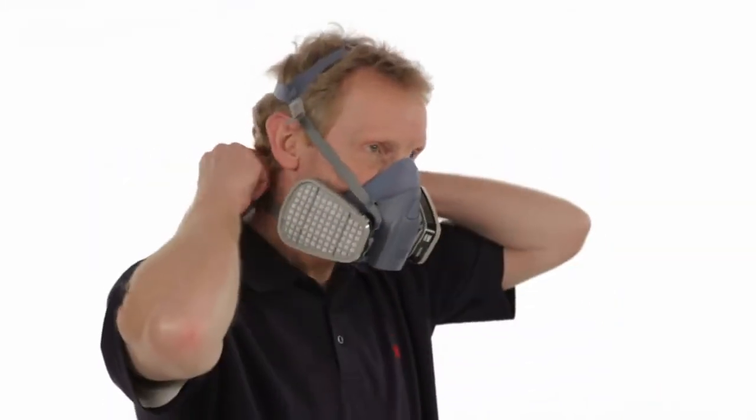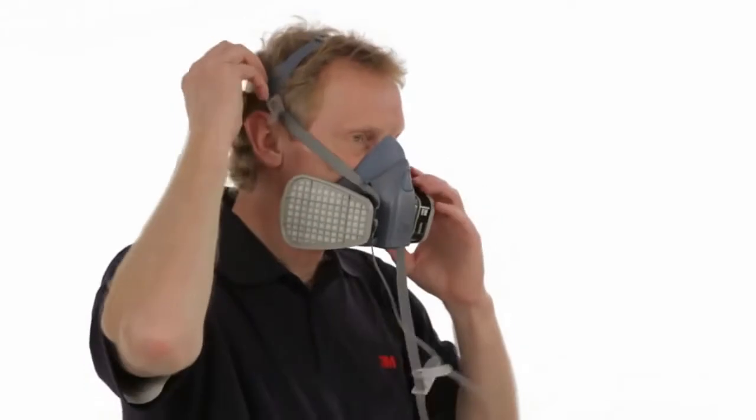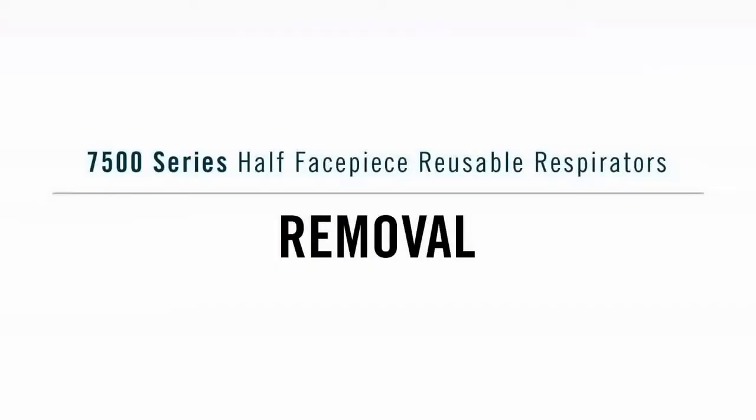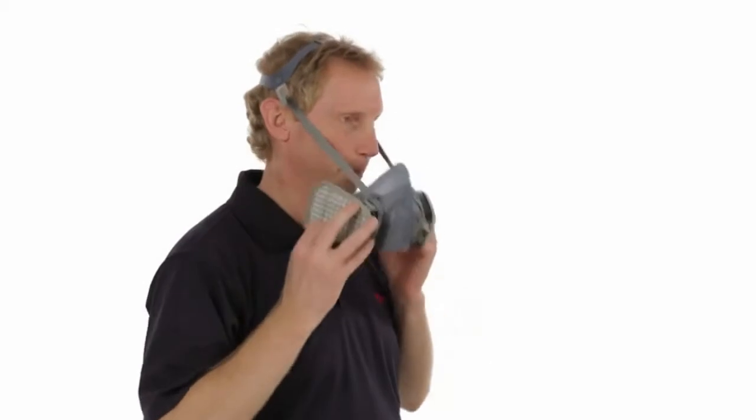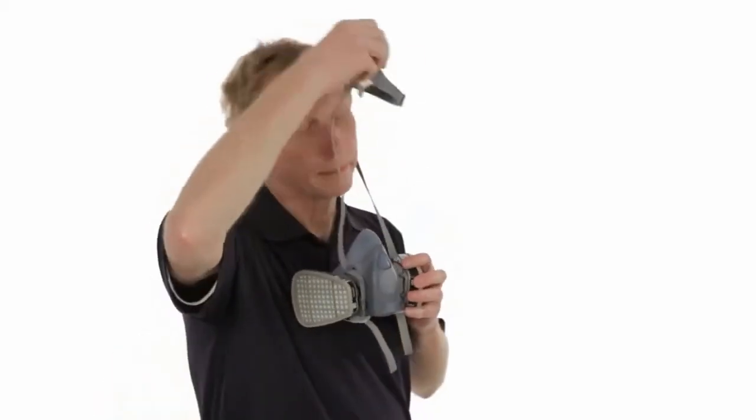Removal, 7500 Standard Mode. To remove the respirator, unhook the lower straps using both hands and pull the head harness over your head. Removal, 7500 Drop-Down Mode. To remove the respirator, unhook the lower straps using both hands, then slide the facepiece down the straps to your chest.